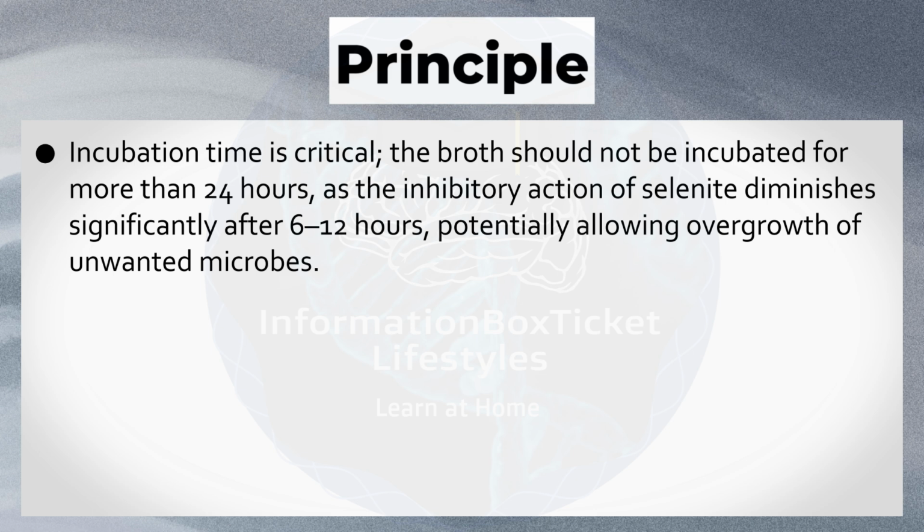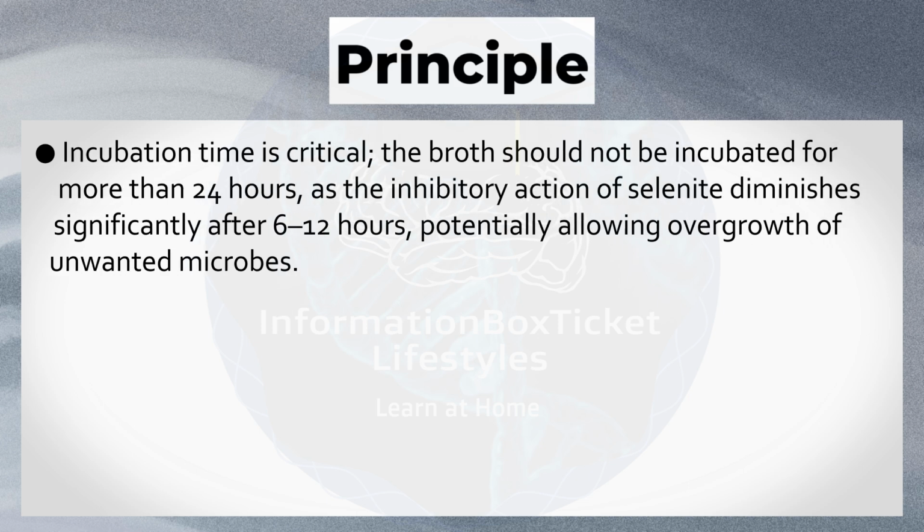Incubation time is critical. The broth should not be incubated for more than 24 hours, as the inhibitory action of selenite diminishes significantly after 6 to 12 hours, potentially allowing overgrowth of unwanted microbes.